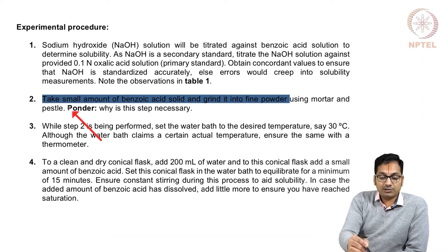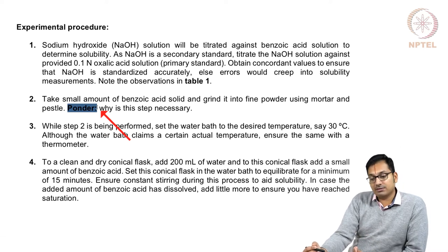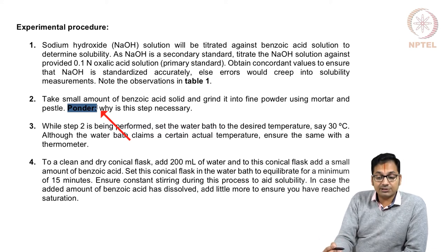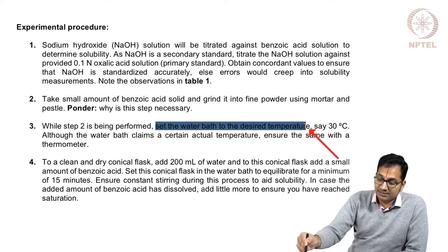This is important. One has to ponder why something like this has to be crushed. You will soon realize that whenever something is a solid and you want to dissolve it, if you are able to increase the surface area, that will help you dissolve things better, which is why we tend to like refined salt, so that it's simple granules which can be mixed. Same with the case of sugar, where you end up adding it to any solution, it dissolves right away. And there are also other reasons to it which we will understand when we go through the theory of the experiment. While step 2 is being performed, set up a water bath to the desired temperature.